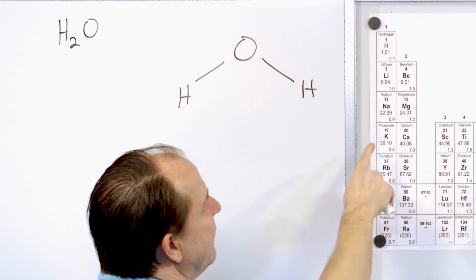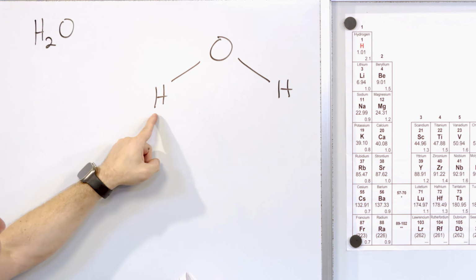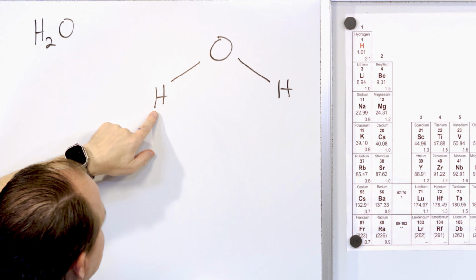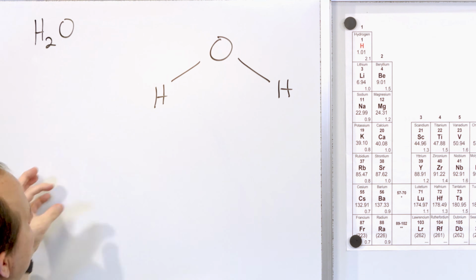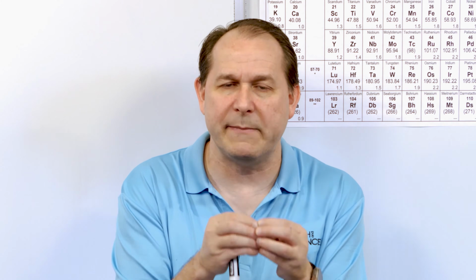So what happens is, because the sodium wants to lose an electron, these hydrogens want to gain an electron, and once they grab the electron from the sodium, they can detach from the water, and the hydrogen becomes free. And the hydrogen can then bond together with another hydrogen and make H2 gas, and then that gas is very hot from the reaction, and because hydrogen is combustible, it catches on fire. And then often an explosion follows, right? And then it's so hot that the sodium metal itself gets molten into a ball, and you can get a splattering of this molten metal, which is really dangerous.